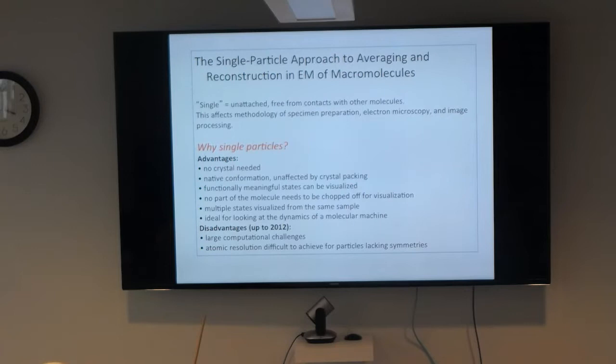And that affects really everything: the methodology of specimen preparation, electron microscopy, and image processing. So all this is completely unique for single particles. While with single particles, it's sort of obvious, no crystals are required. It gives you the native conformation, which is unaffected by crystal packing.